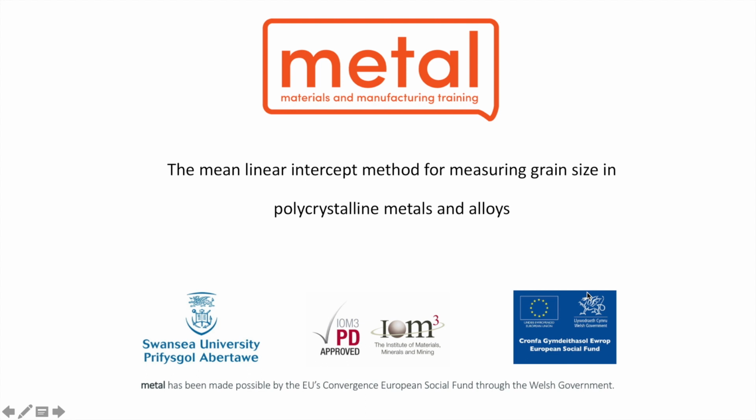Hello, this is Michael Shakib from Swansea University and Project Metal, and in this video we are going to explore some methods to try and determine the average grain size of a polycrystalline material using something called the mean linear intercept method.